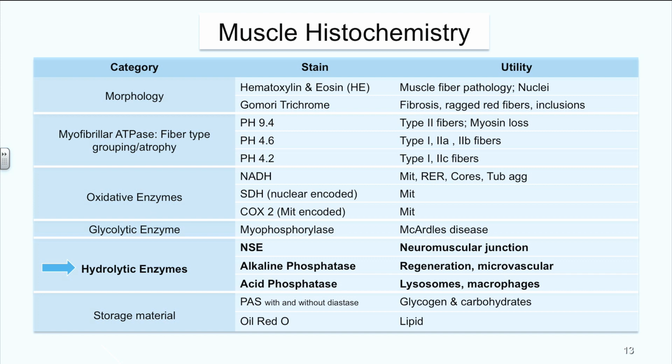We are going to jump to the hydrolytic enzymes. The reason is that there will be a combination of studies of ATPases and a subset of hydrolytic enzymes called non-specific esterase to give you some neat examples of pathology. Focusing on non-specific esterase, this is an enzyme and this is a reaction that we use to assess the state of innervation of the skeletal muscle.